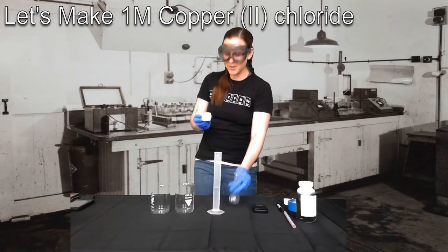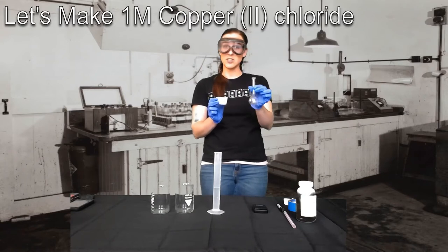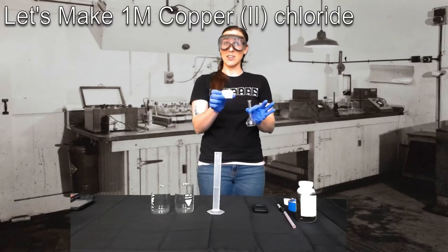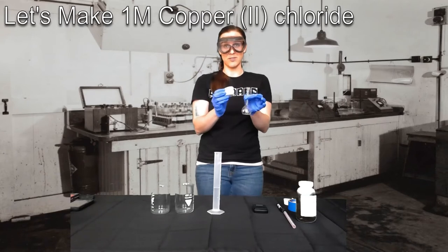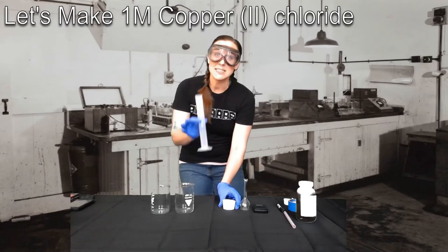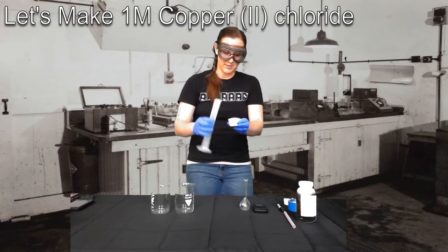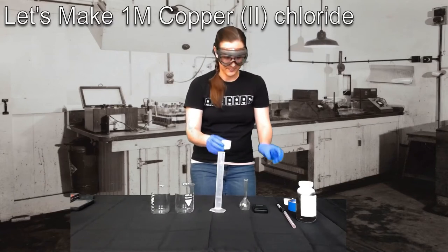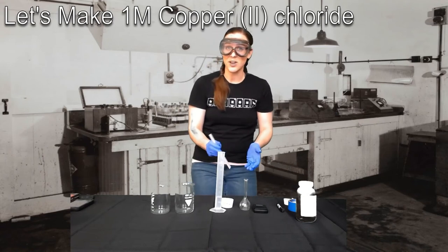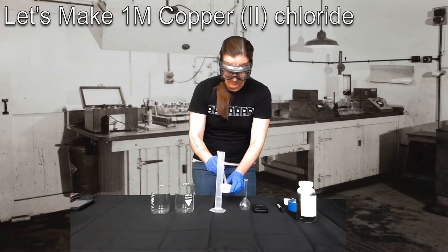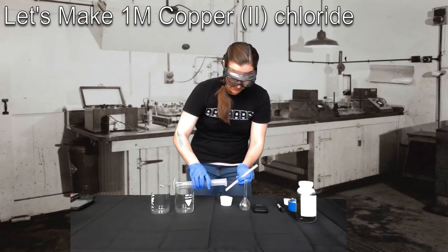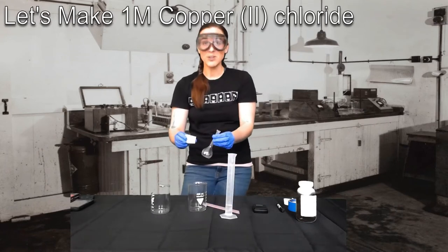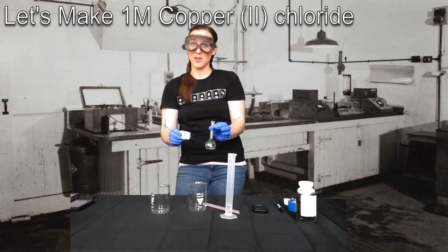Now you might be wondering, how am I going to get all of this solid CuCl2 into this little tiny volumetric flask? The easiest way to do that is to make a type of slurry of what's in the weighboat and then add that to the volumetric flask. The way we're going to do that is by adding some DI water, deionized water, into the weighboat, just so that it can get into a little bit of a solution and make it easier for us to add it into the volumetric flask.